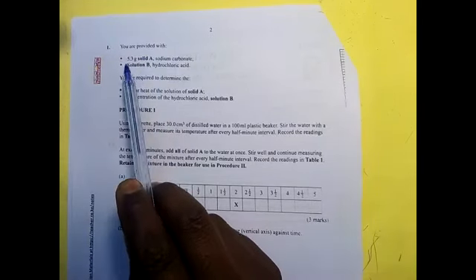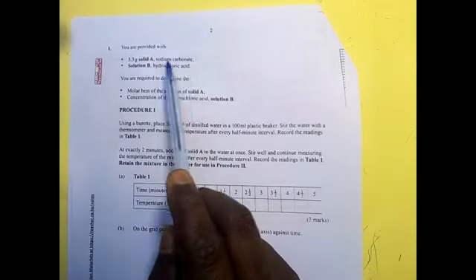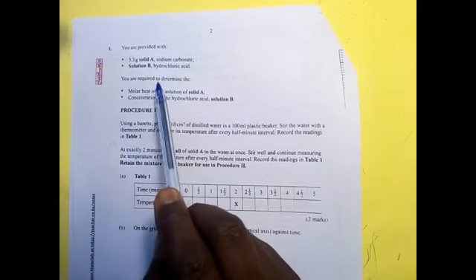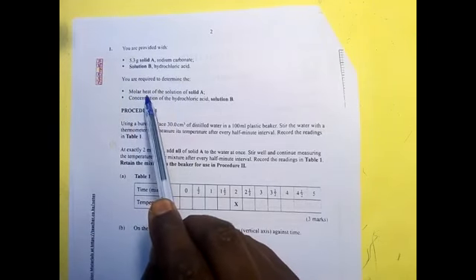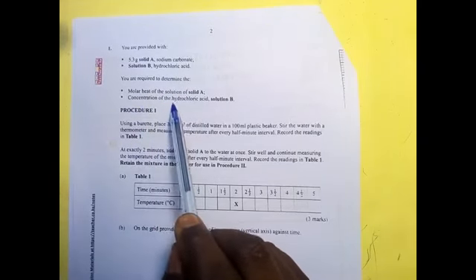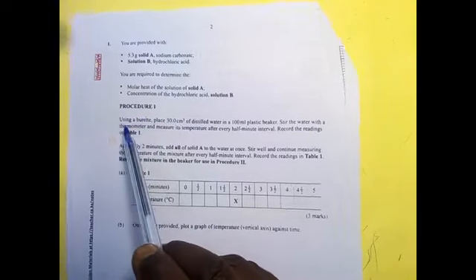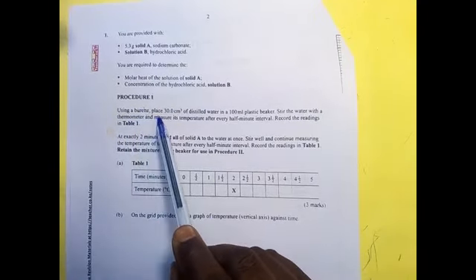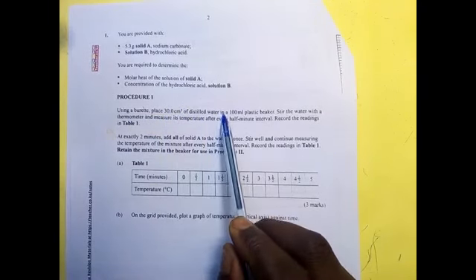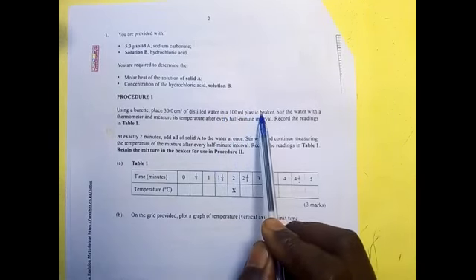You are provided with 5.3 grams solid A, sodium carbonate, solution B, hydrochloric acid. You are required to determine the molar heat of solution of solid A, and the concentration of the hydrochloric acid, solution B. Procedure 1. Using a burette, place 30 centimeters cube of distilled water in a 100 milliliter plastic beaker.